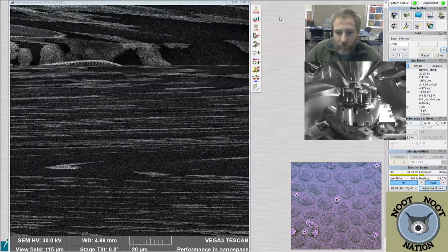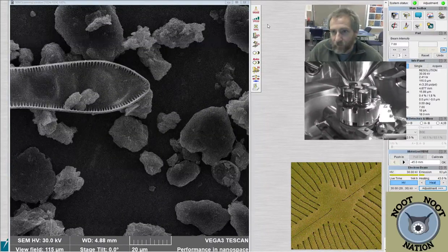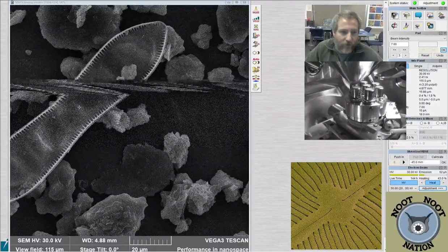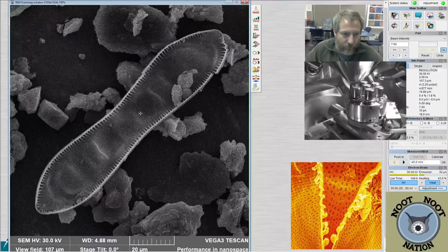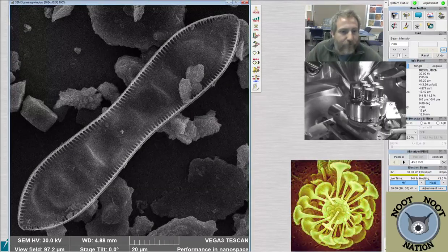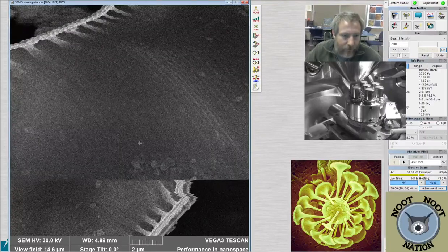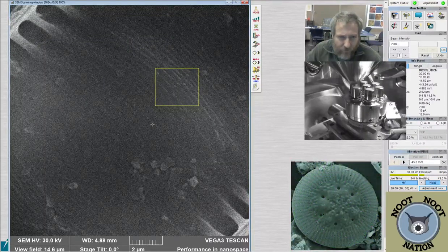So I'm just trying to image it, and that requires me to turn the camera. I'm actually just turning the stage. And I'm trying to get it to 45 degrees like it is here, or close to it, so that we can zoom in and I can get the entire image corner to corner. Like so. This is a pretty diatom, and it's relatively clean. The focus real tight like this.